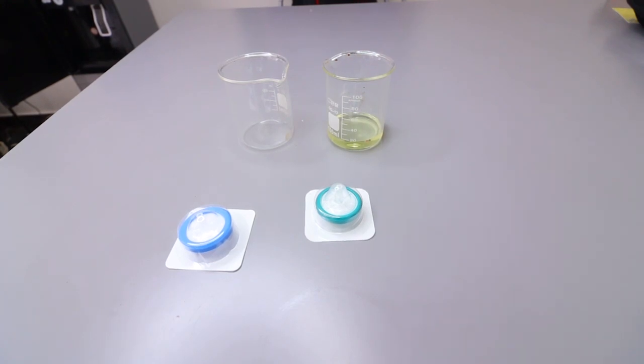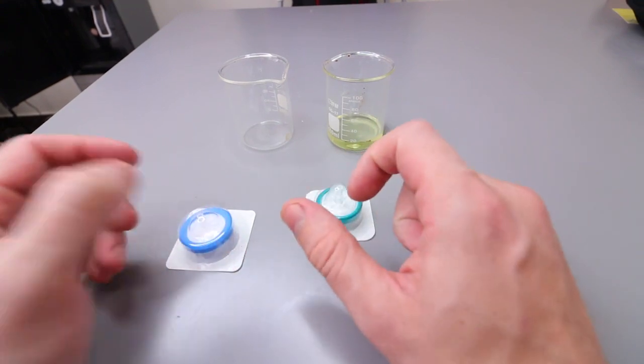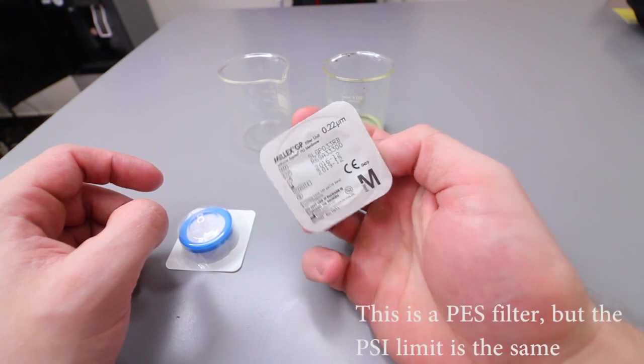All right, what is up internet. Quick video for me, I just want to talk about different filter types. Our filters that we sell are PVDF 0.22 micron filters and I want to talk about why we sell these.